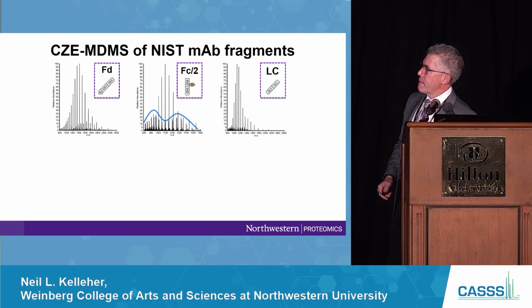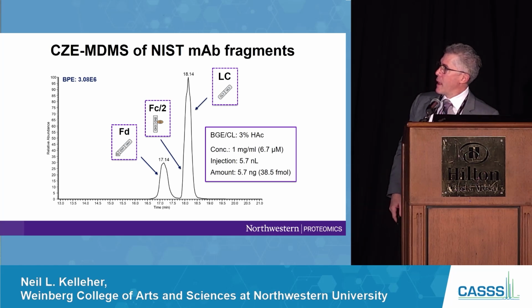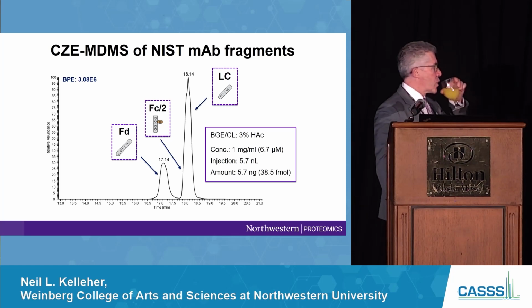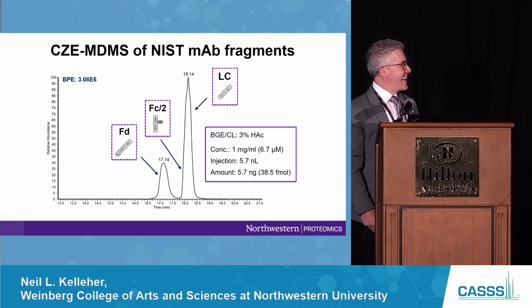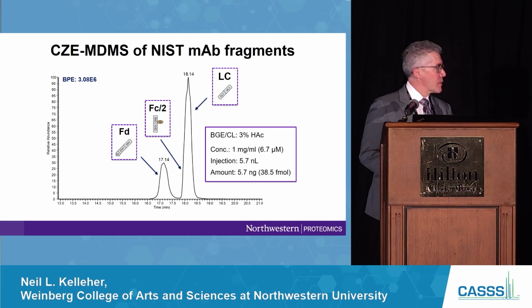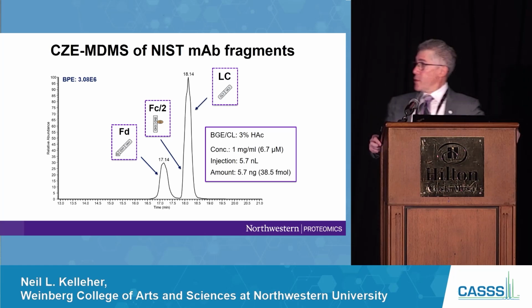What's the peak width required? Usually those colleagues are using LC chromatography with rather broad peaks. Combining these different fragmentation techniques and getting to 90% sequence coverage will take some time, I assume. What peak width do you think is feasible while getting such good sequence coverage? With coupling CE-based techniques to mass spec, maybe it's interesting for us nowadays to do ICIEF-MS, and the peaks are not minutes wide, not seconds wide, but something in between. Do you think this would also apply, or that it would be possible to get in these ranges with a CE-based assay?